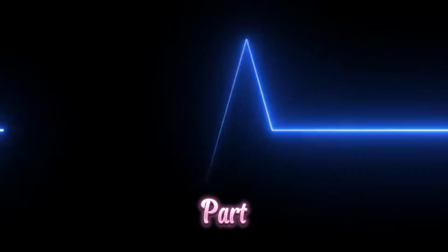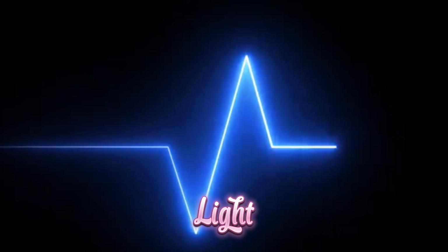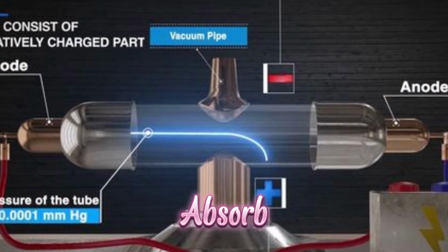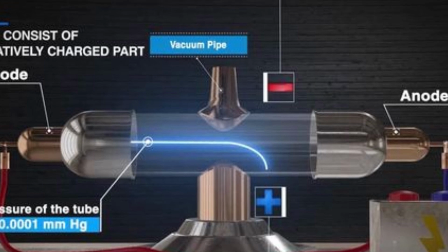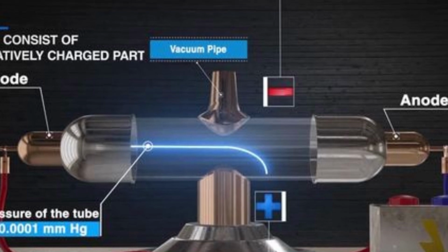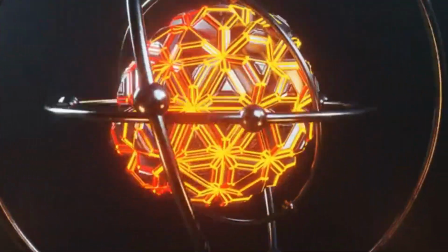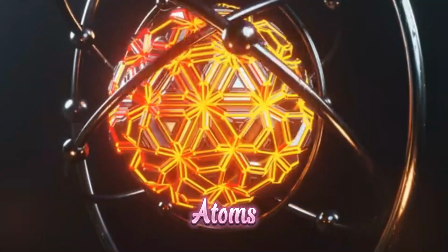Now here comes the clever part. Each chemical element has a unique light signature. Think of it like a fingerprint. To read this fingerprint, we shine a special light through the flame. This light isn't just any old light bulb. It's a special lamp called a hollow cathode lamp that emits light at the exact wavelength that our target element loves to absorb. For example, if we're looking for sodium, we use a sodium lamp. This lamp shines light that is specifically tuned for sodium atoms.